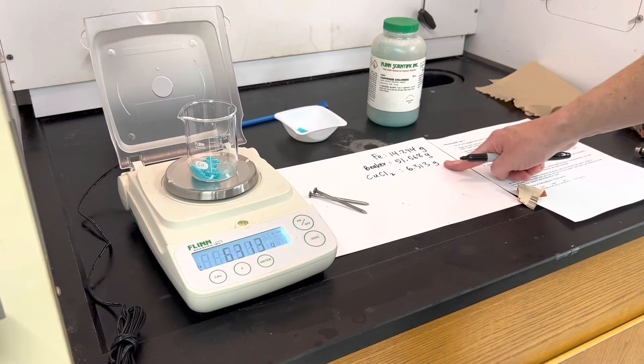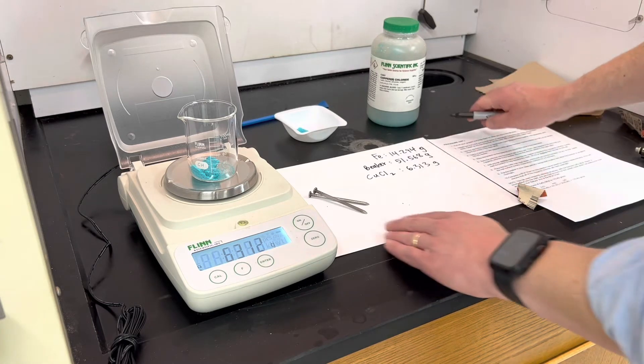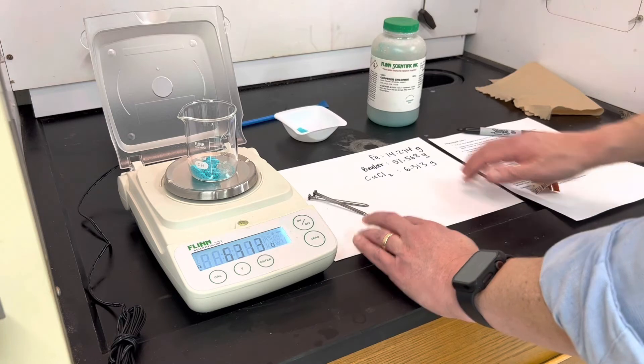The copper chloride is going to dictate how much of this reaction goes. We're going to form copper through this reaction. That really is probably your most important measurement because everything else will hinge on that.